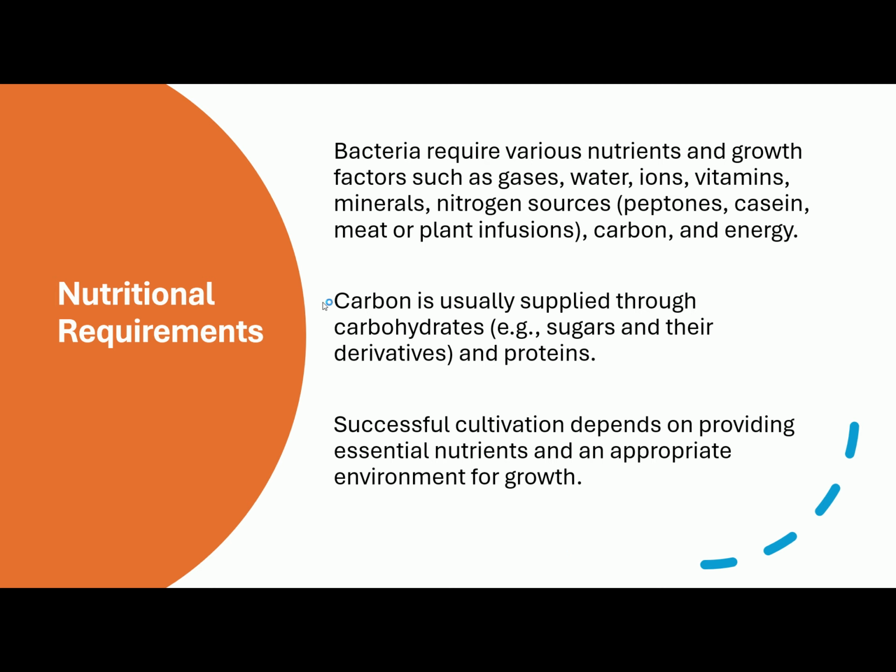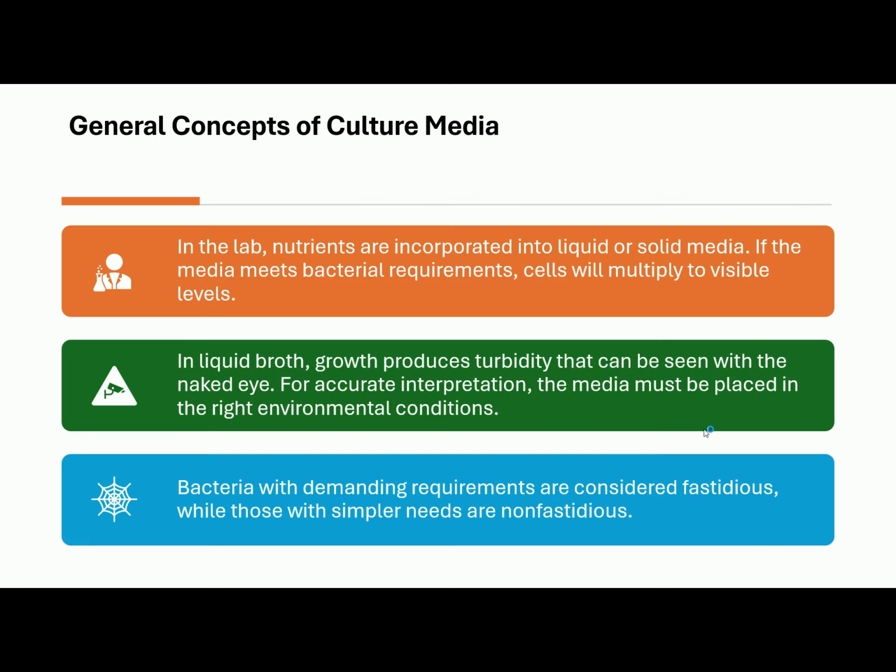Carbon, class, is usually supplied through carbohydrates. So, the carbon source used by bacteria usually comes from carbohydrates, the sugars such as lactose, sucrose, fructose, as well as protein.